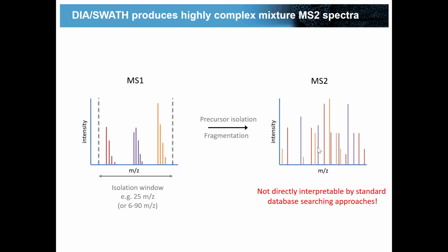And you would need to be able to do that in the course of 2 or 3 seconds. So it would be 2 or 3 seconds divided by 800 would need to be the scan time for a single scan. So this might not be too far away. I mean, it could come in the next sort of 2 or 3 generations of mass spectrometers. And I think eventually these things will converge, and then it's going to be a question of how to analyze the data.